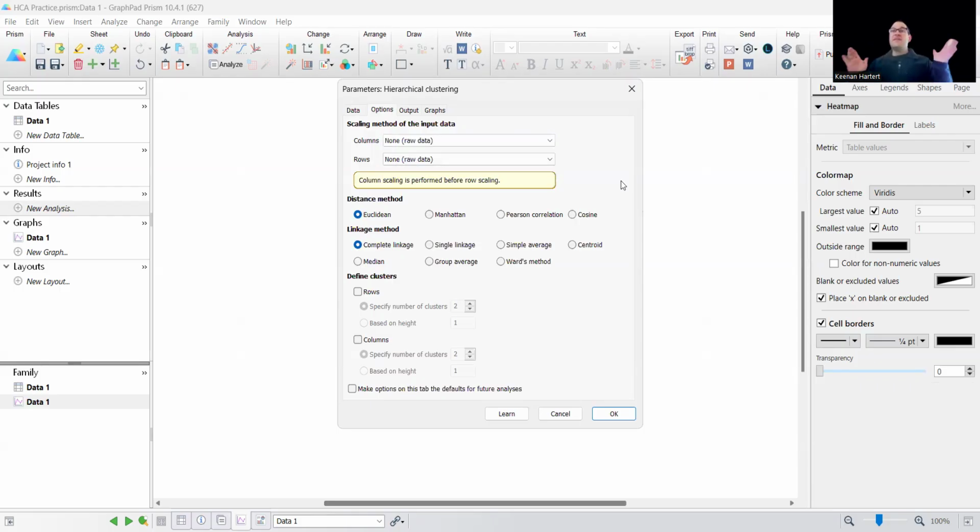That's fine. If you have really bouncy data, like RNA-seq, for example, where the numbers are up and down and some of the genes aren't relative, you can make them relative using standardize or center right here. And it's going to make things really nice, and you won't end up with one of those heat maps that's really splotchy in some areas. So looking pretty good here. Again, I want the linkage. That's my main thing. There's a lot of options right here.